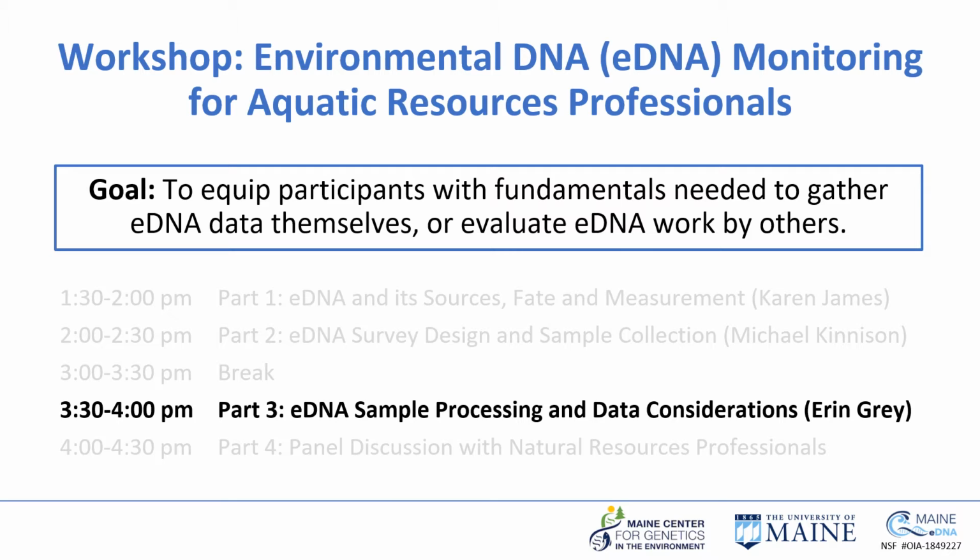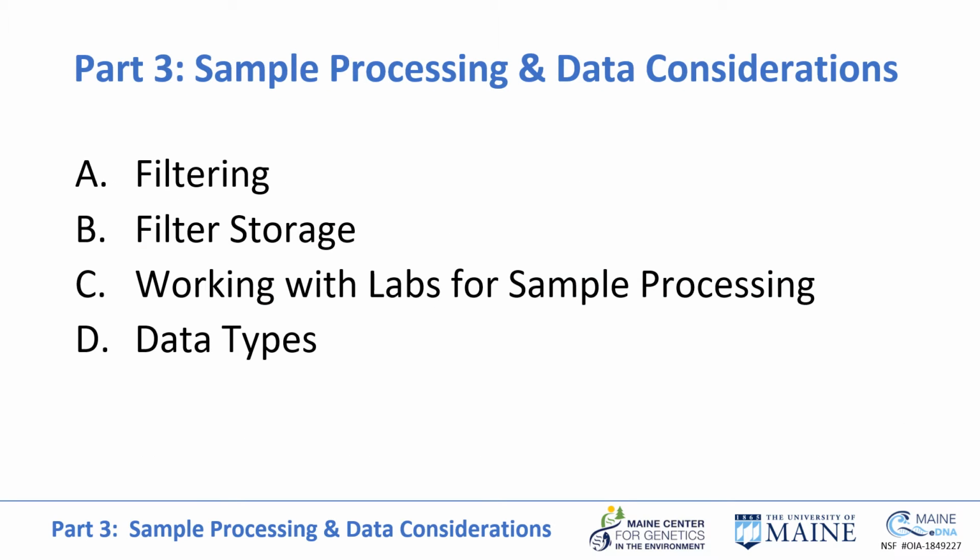I'm really sorry I couldn't be there with you today to talk about eDNA, but I'm happy to make this recording talking about eDNA sample processing and data considerations, or what to do with your water sample once you collect it. Here's an overview of what I'm going to be talking about today. This is not an exhaustive list of all aspects of sample processing and data considerations, just the main points that you have to think about when you're starting to plan your study.